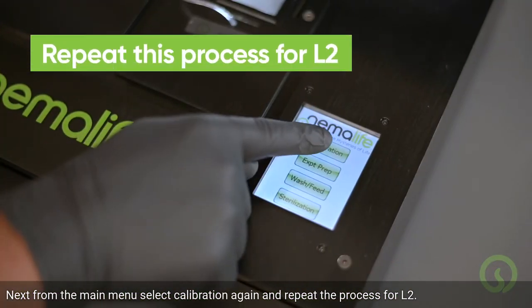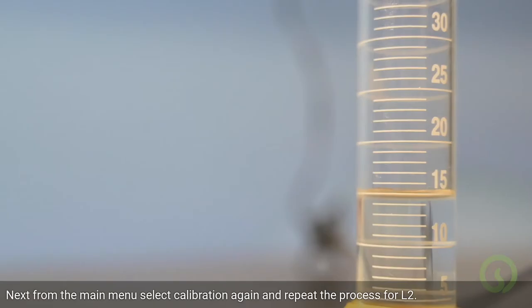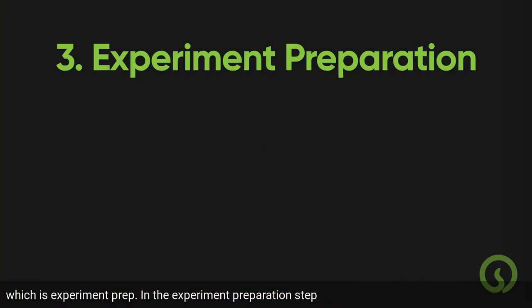Next, from the main menu, select Calibration again and repeat the process for L2. Once both pumps are calibrated, you're ready to move on to the next step, which is experiment prep.